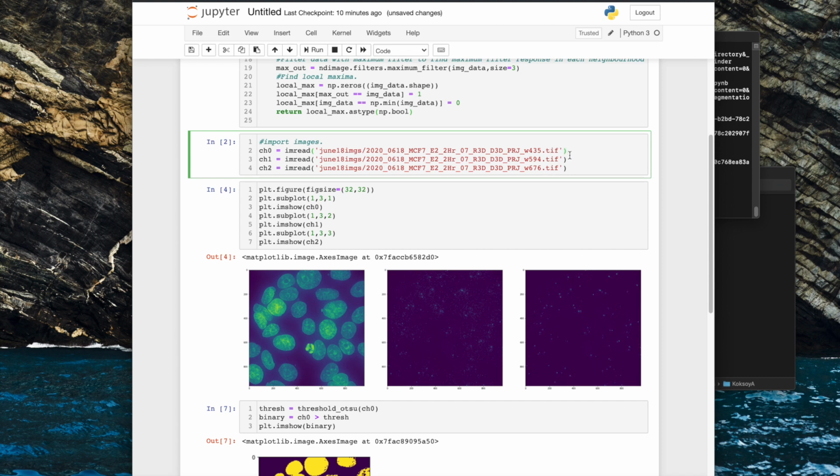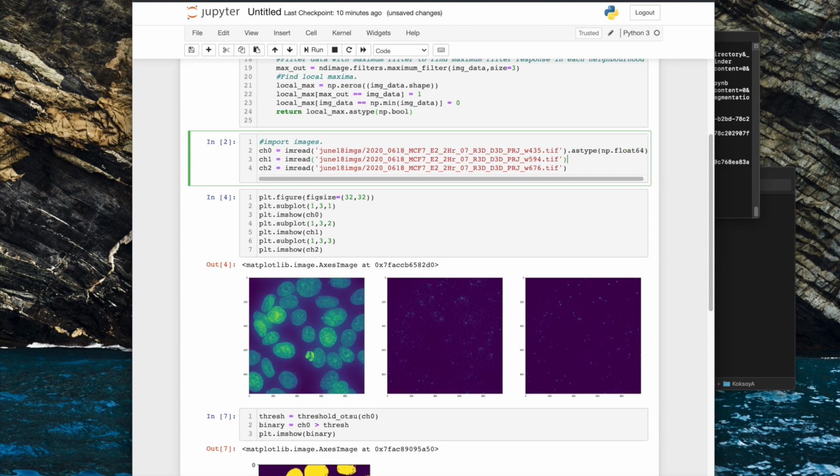If you import the images, they may be in a certain bit depth, but if you convert to floating point, then when I do division and things on these images, the data type of the pixels will accommodate any divisions and multiplications that I do, rather than doing some rounding without me being aware.